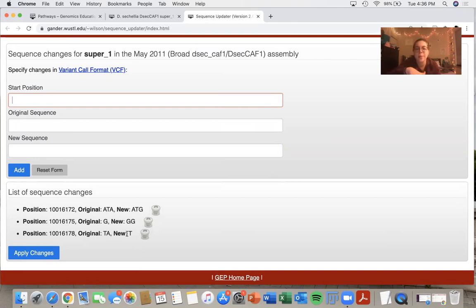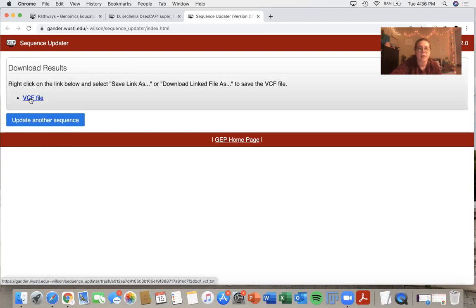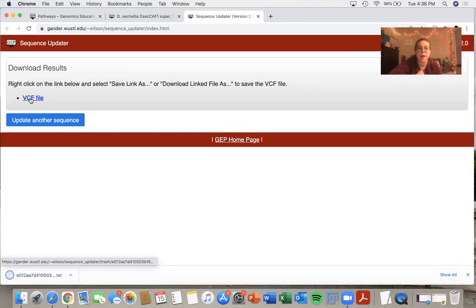So once I submit all of the changes that I think are necessary, I would simply select apply changes. And I click on this VCF file and it downloads.